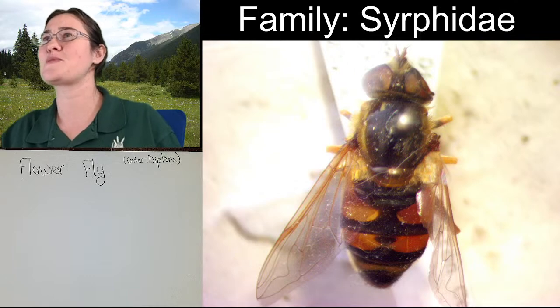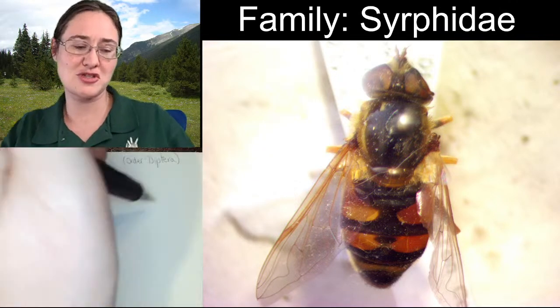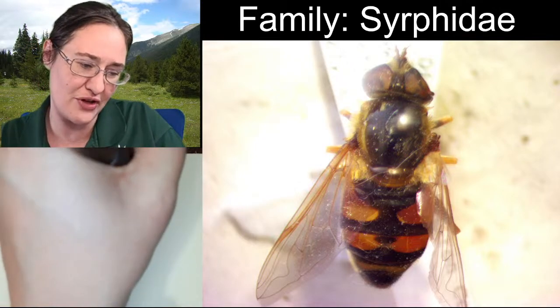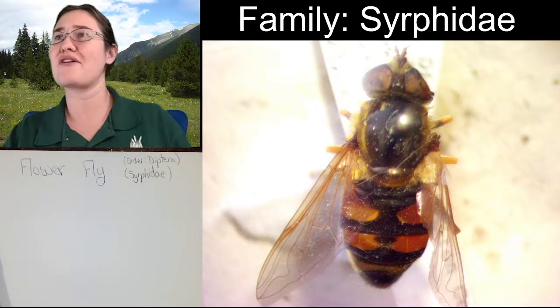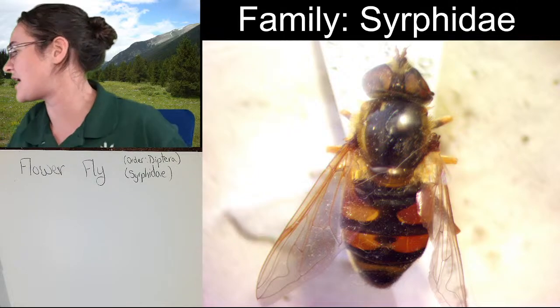Oh, yeah, that's how you spell it. It didn't look right for a minute, but that is how you spell it. They are called Syrphids, or they're in the family Syrphidae. Now, for the exact genus and species on this specimen, I'm not exactly sure.